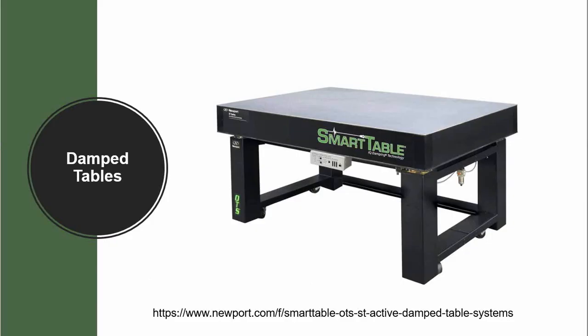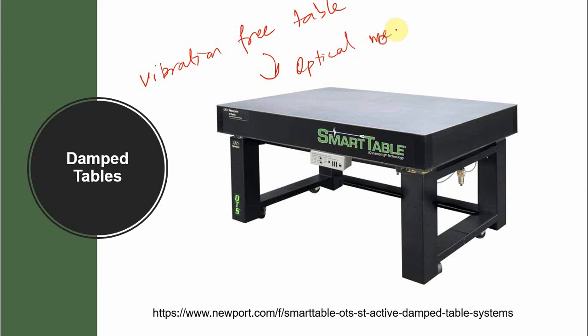For example, this is a smart table which can actually assist in dealing with the external vibrations. It is equipped with technology which doesn't allow the vibration or compensates for the vibrations. This one is quite a sophisticated table, but there are other tables which can be used for small external vibrations, or you can say that we should use a vibration free table. Usually these tables are also used for optical measurements.